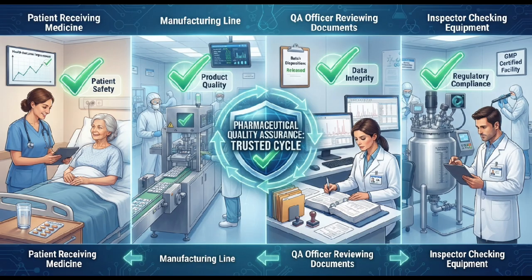Why cleaning validation is important? Cleaning validation protects patients by preventing cross-contamination. It also ensures compliance with GMP regulations, improves product quality, reduces batch failures, and builds confidence during regulatory inspections.